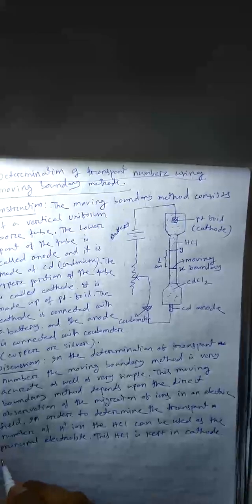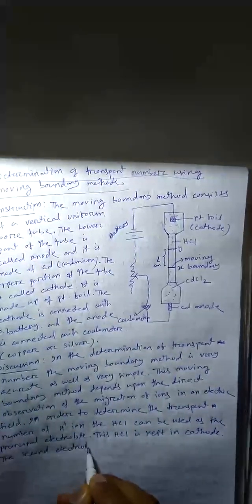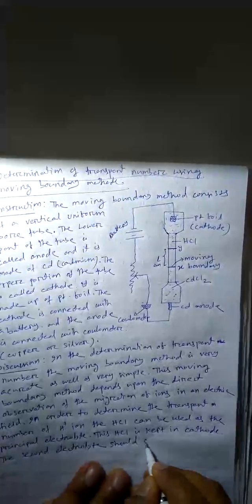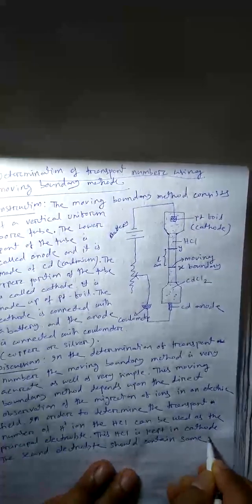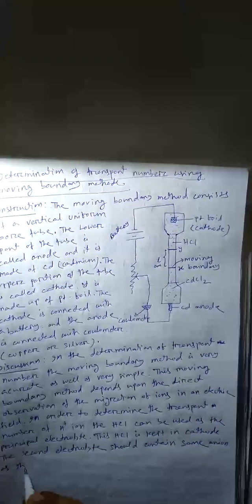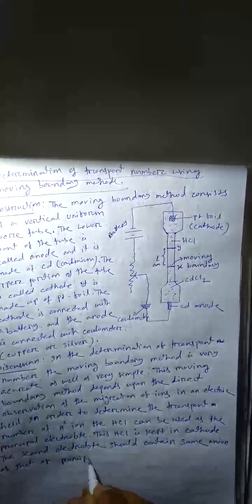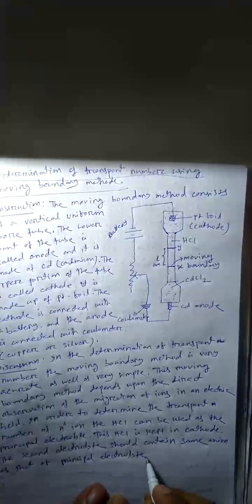Similarly, the second electrolyte should contain the same anion as that of the principal electrolyte.